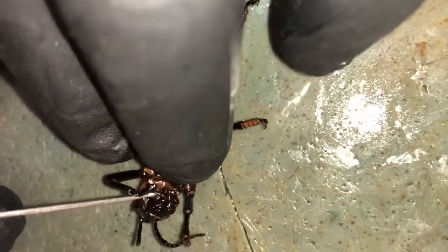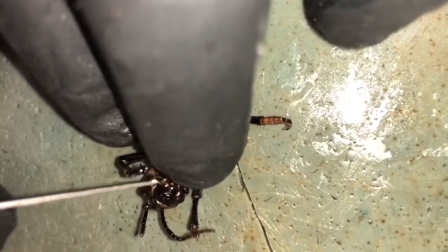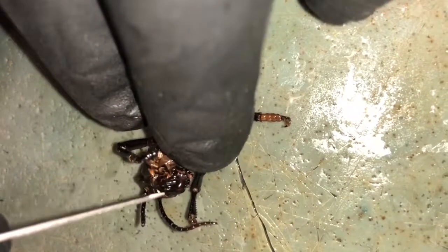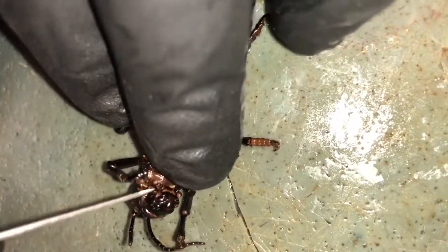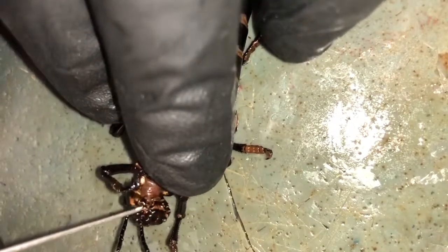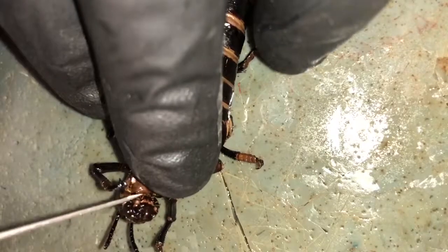Can you push it down? Okay, good. Gosh, so hard to see. Yep. And then labial palp, please. Labial palp right here. Maxillary palp. Maxillary palp right here. We got them backwards. Maxillary palp. Labial palp. Good. Mandibles.